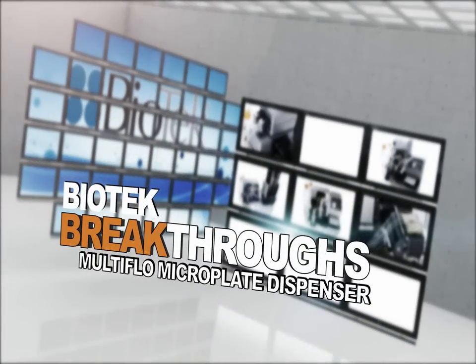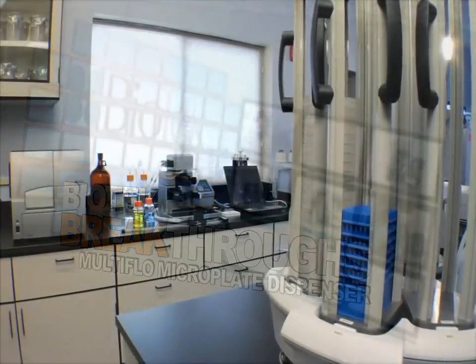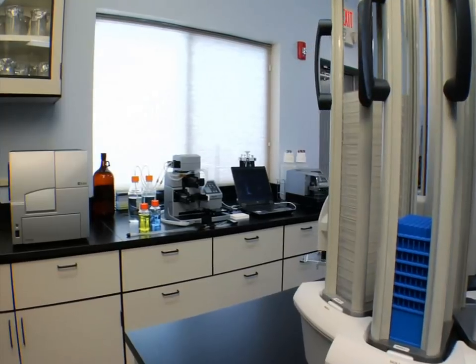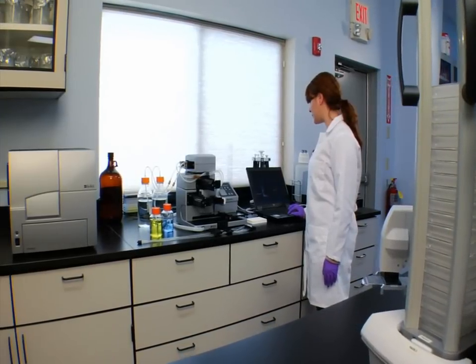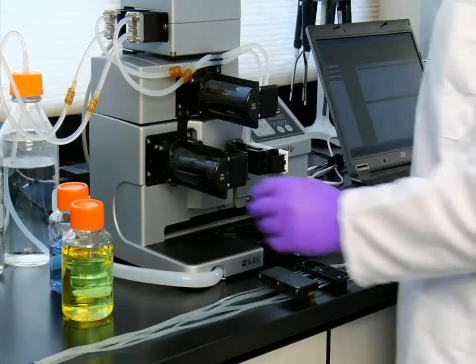Welcome to another biotech breakthrough. Today's researchers use both pipetters and dispensers to fill microplates with a variety of reagents in biochemical, cell, and bead-based assays.